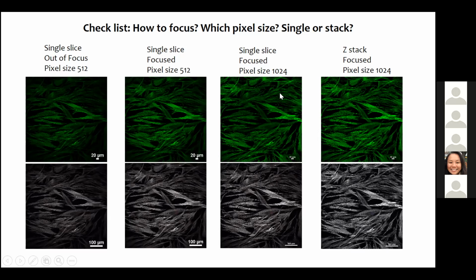So you can see at a higher magnification I was able to get a little bit more detail where it was missing over here. You're actually picking up a lot more minute details that you would be missing at a lower pixel size. So please remember that if you are showing something, especially at an organelle level or a single cell level, you want to aim for a 1024 pixel size, because it's going to look great on the software of the microscope, but when you convert it and put it onto a PowerPoint or a PDF, you're going to lose most of that resolution.